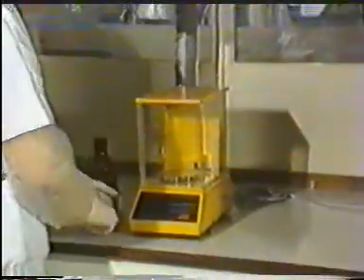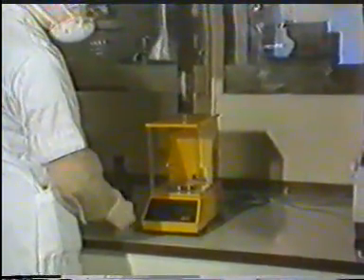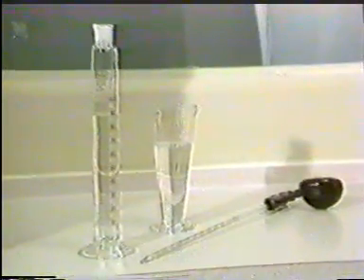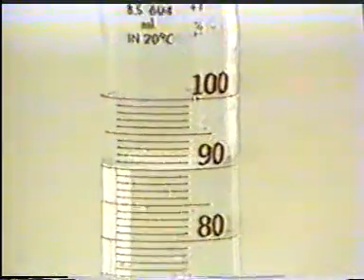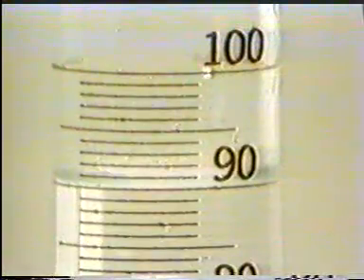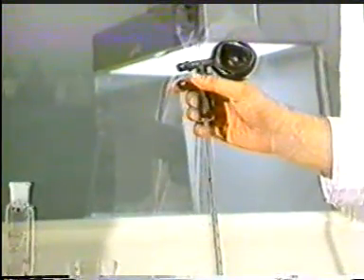Of the raw material to the material of the vessels or spatulas used. Measuring by volume should be carried out in calibrated vessels. Select the measure carefully, choosing one with a volume equal to or just above that of the amount required. Correct measurement is to the bottom of the meniscus. Small volumes, that is less than 5 mls, should be measured in a pipette. A pipette filler should always be used.